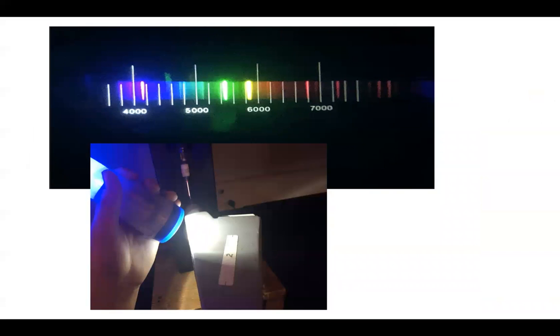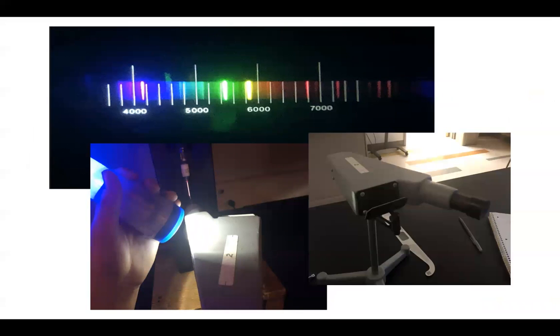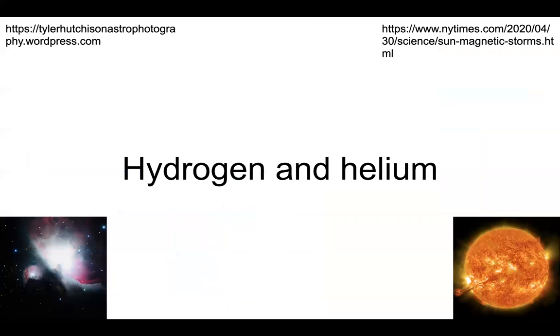So one other thing I did too, I found this helpful. I took pictures actually of the spectra of each lamp. This was using the visual spectrometer, and this was really just more qualitative. Helped me visualize exactly what was going on, exactly what I was looking at. But again, the actual analysis was done using the digital data.